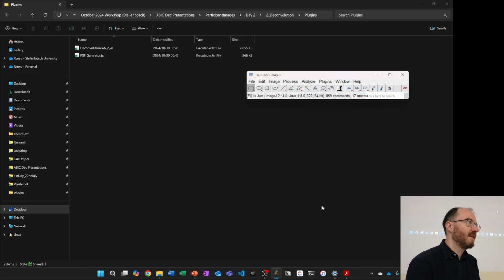Yeah, so the preferred thing is to keep things consistent. You would usually go between your different biological repeats, find some representative samples, play around with all of these parameters, figure out what is one set of parameters that works well across all of the repeats, and then apply that consistently. Obviously, that wouldn't apply to a different set of experiments, but for your set where you try to keep everything consistent, the analysis should also be consistent.